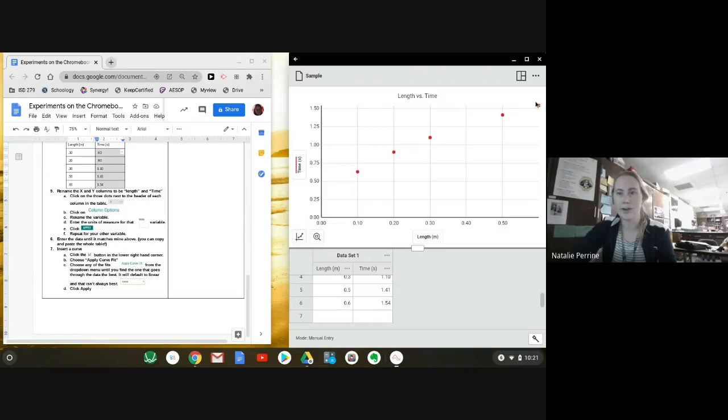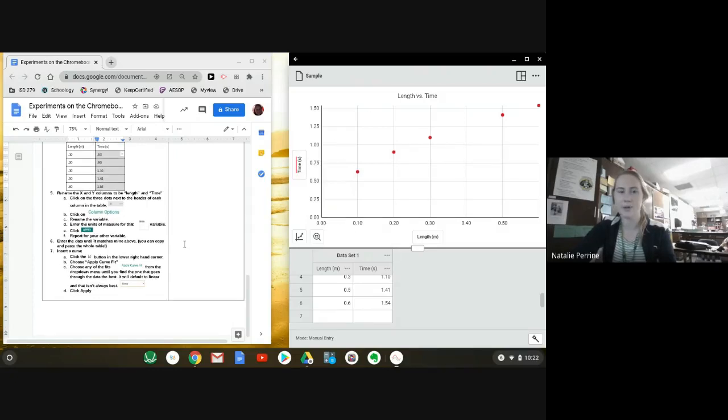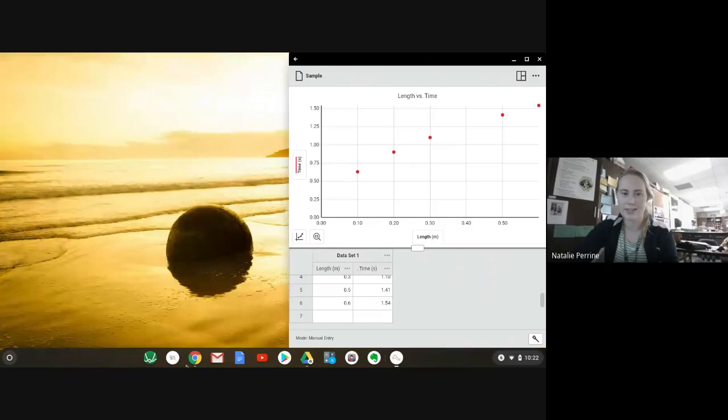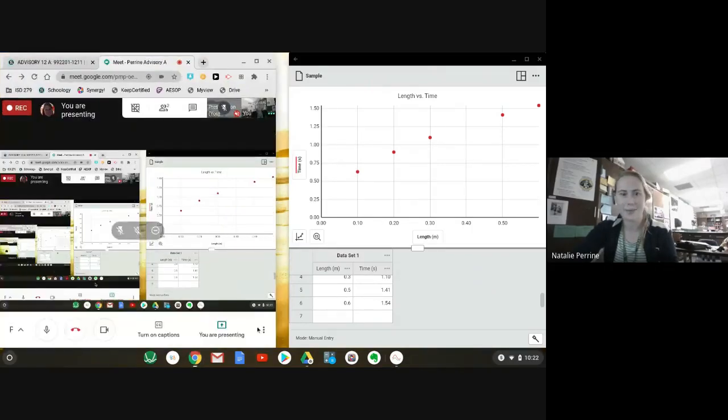So you can get rid of the things by Xing out, but for this, I want you to choose the best curve fit, do a screenshot of your example, and paste it under the proof column and turn in your assignment. Hopefully that helps you to get this done. There are many other things you can do with this, but that was all for today.